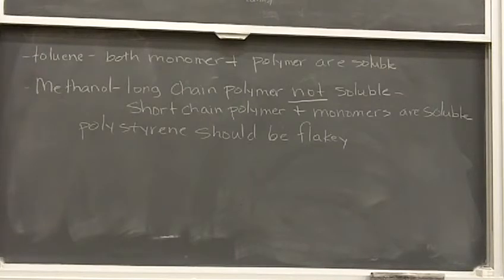Now another thing with this reaction is you'll want to note from last week what your bromoethyl benzene looks like before you even go into the styrene reaction, because it might have changed. It might be darker, it might appear different, okay?